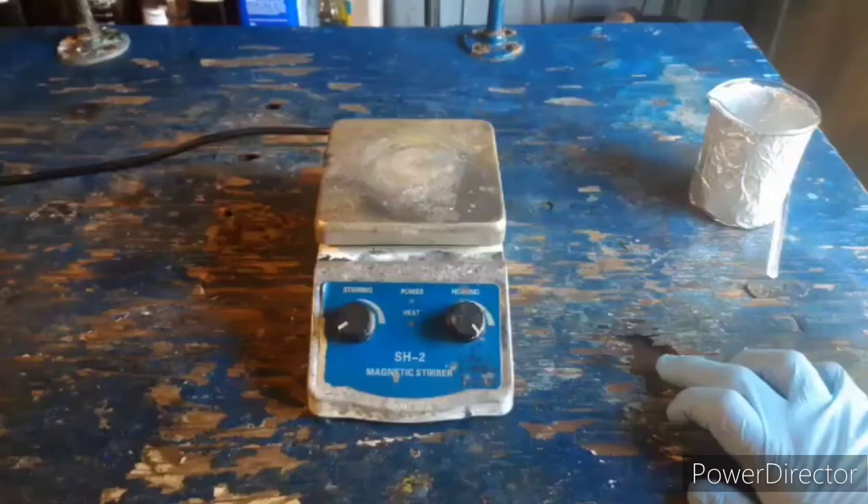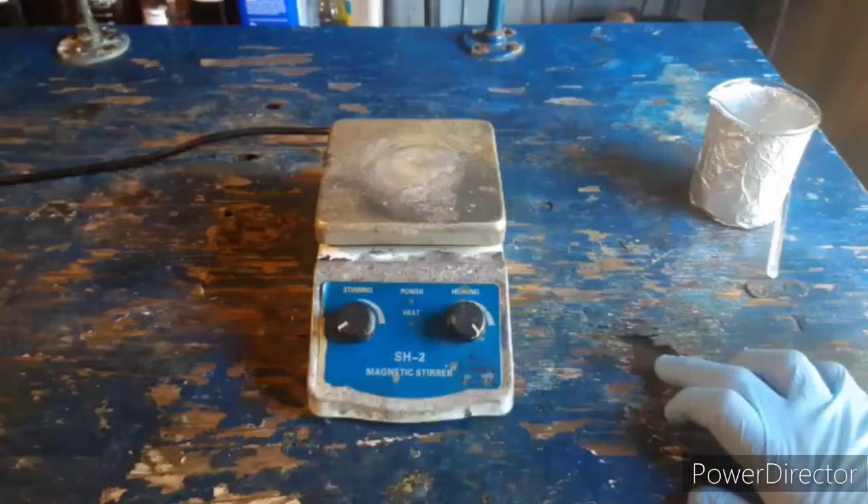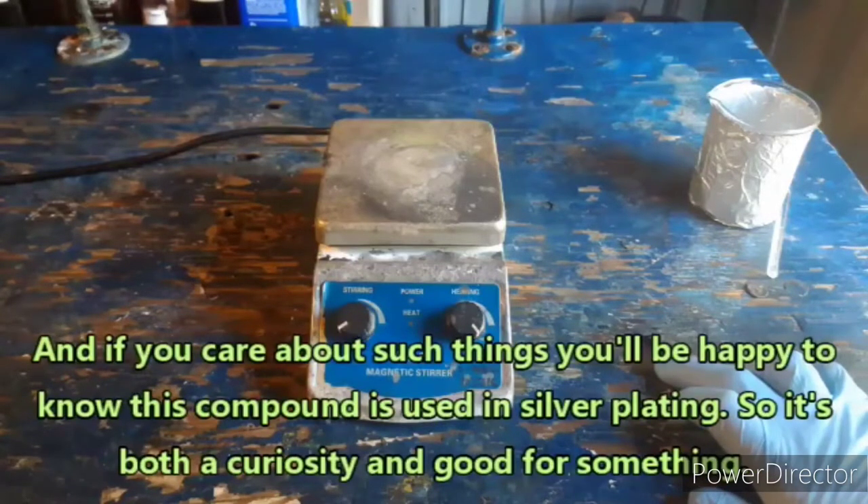Hello everybody and welcome back to the Poor Man's Chemist. In this video I am going to be making potassium dicyanoargentate, probably a little sodium dicyanoargentate too, since that pesky sodium ion is still in the cyanide. I still haven't figured out a way to really deal with that effectively — not yet, but I'm still working on it.